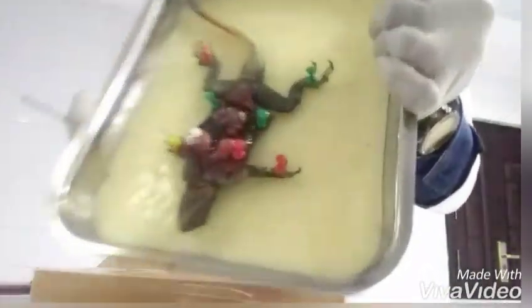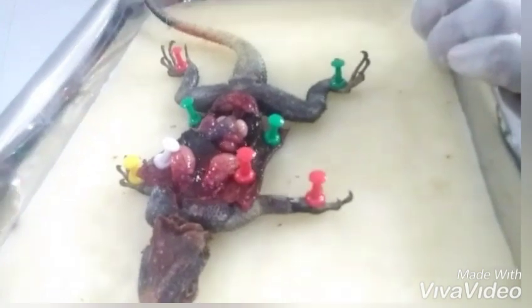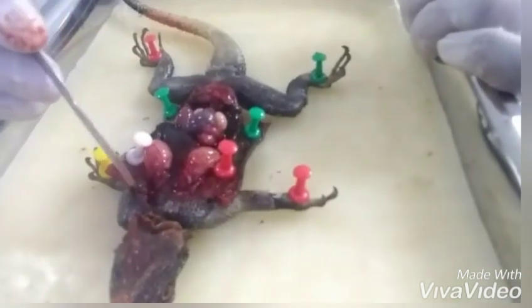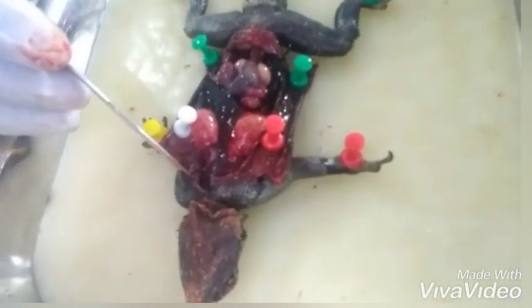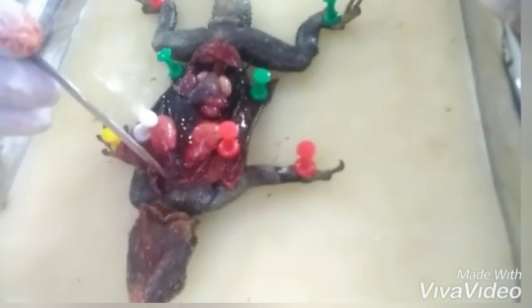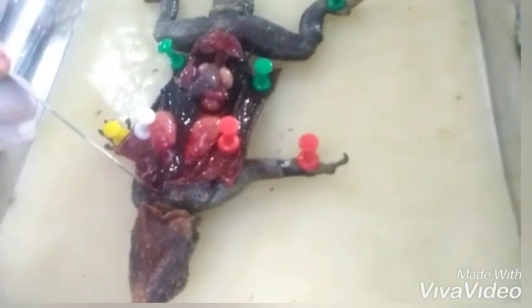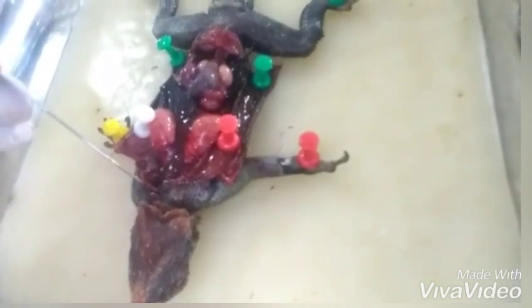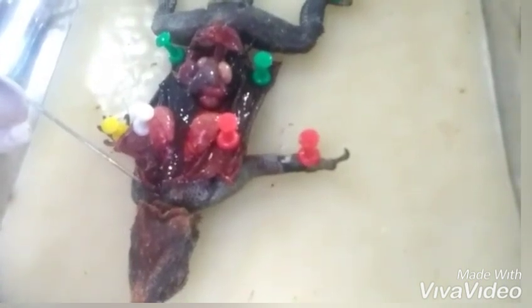Now we're done dissecting our lizard. Have a look — the heart is still intact and it's beating, still pumping blood to the rest of the body. Here in the thoracic cavity, where we cut open, you can see this little organ — it's reddish-brown in color. It's still pumping blood. If you listen to the heartbeat it should be lub-dub, lub-dub, lub-dub. You can see the movement of the lizard's heart, which tells us the lizard is still alive. That's the heart beating right there.